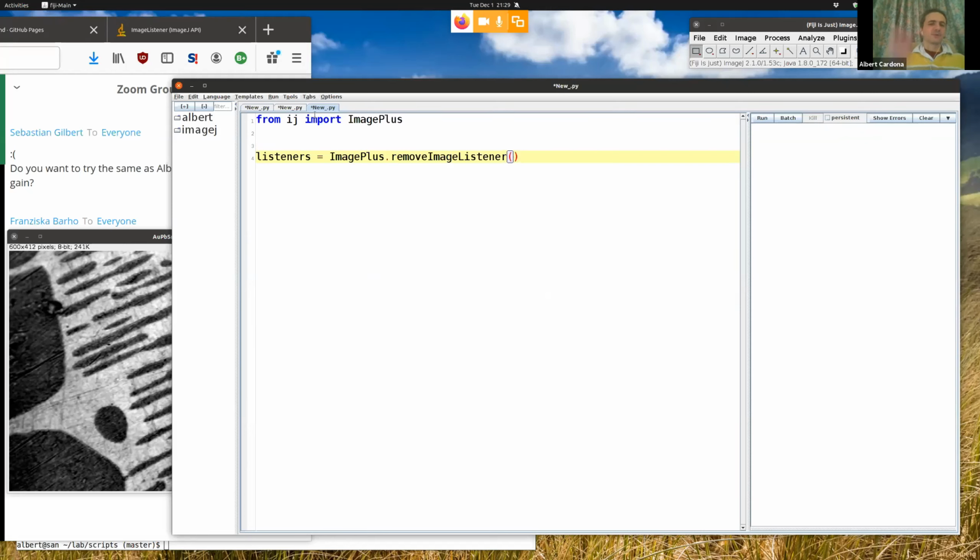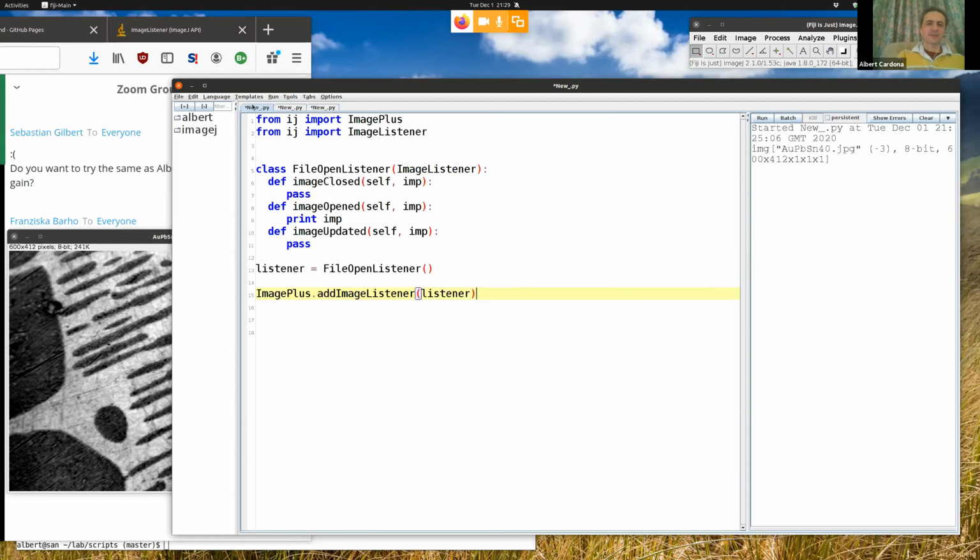okay, let's spend a minute doing this because I see that it's something we should have clear. Listeners can be added and can be removed before I go into frames and UIs. So here we made a mistake of not having a pointer to our listener. By a pointer, I mean we lost this variable. Once the script was run, since we didn't make it persistent, I have lost everything that was in there.